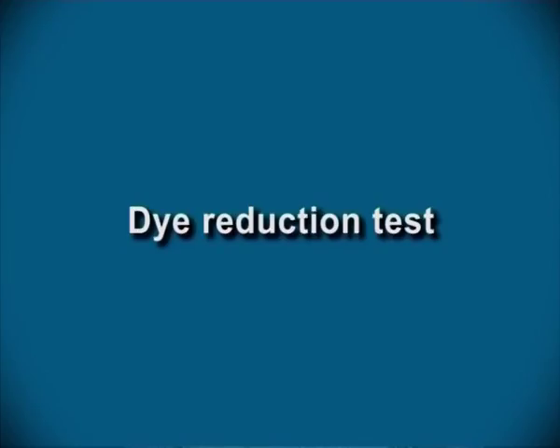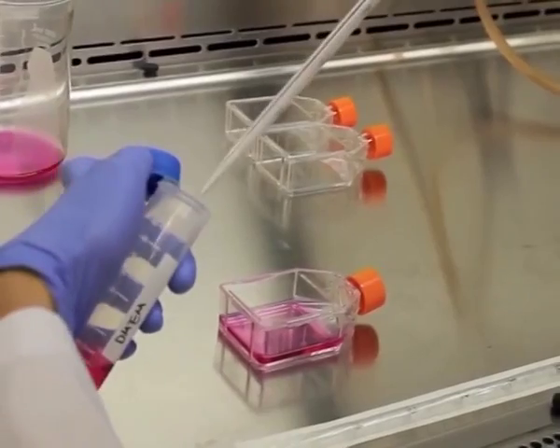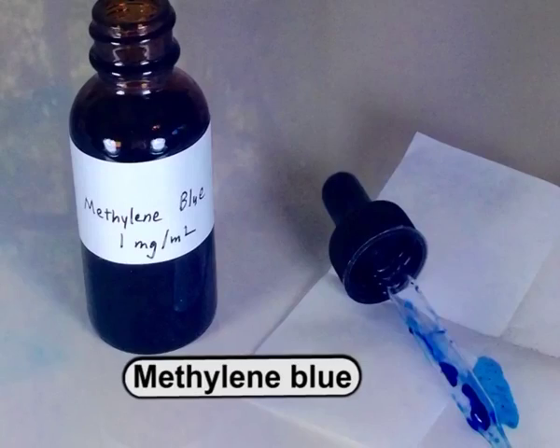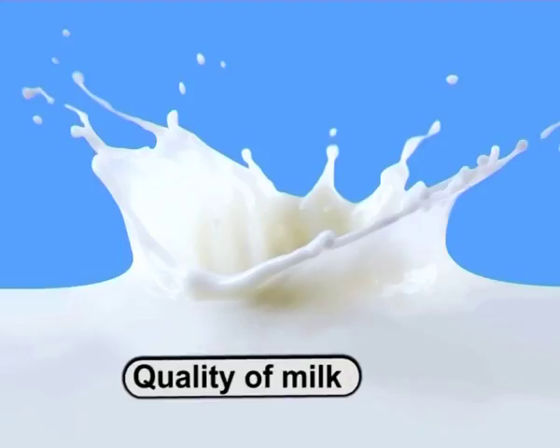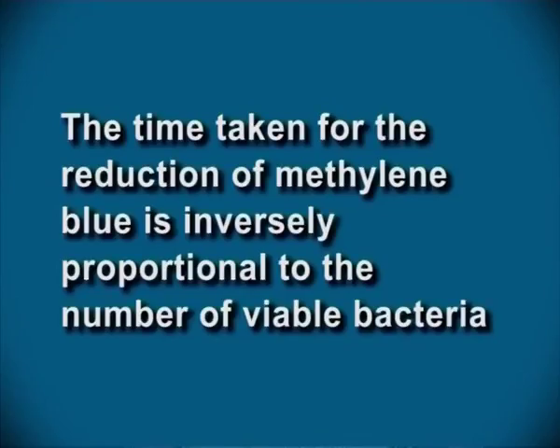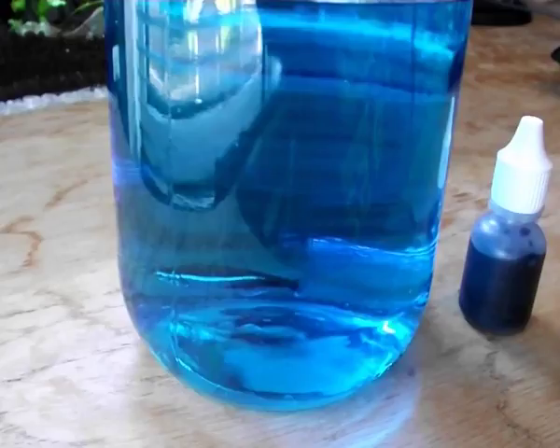Let's learn about dye reduction test. Dye reduction test involves the use of redox dyes like methylene blue to determine the quality of milk. Methylene blue is reduced and loses its color in the presence of actively growing bacteria. The time taken for the reduction of methylene blue is inversely proportional to the number of viable bacteria. The shorter the methylene blue reduction time, higher is the microbial count and poorer is the quality of the milk.